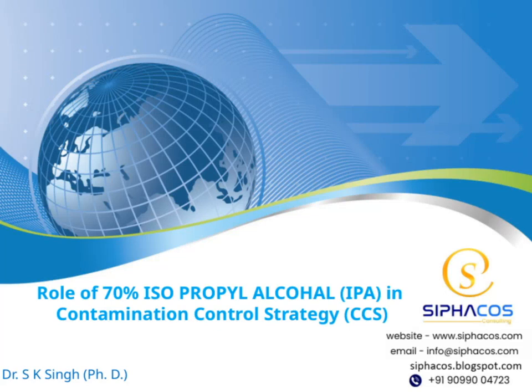I'm delighted to welcome you to this presentation on the role of 70% isopropyl alcohol in contamination control strategy. Today, we'll explore how this essential sanitizer contributes to maintaining cleanliness and safety in our processes. We'll cover its applications, benefits, and the importance of proper use to ensure optimal contamination control. So, let's get started and delve into this important topic together.